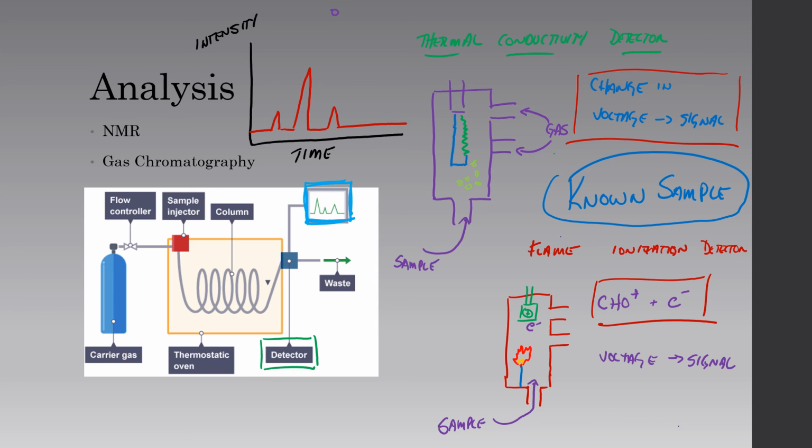If you remember on the previous slide, we had purple, right? And we had blue things that are coming through. So hopefully if we have our gas chromatogram set right, we would see one spike for blue and one spike for purple. Now, for those of you guys still paying attention, we notice we still have that one spike that's out here. Now we have to inject our blue and purple using a solvent.